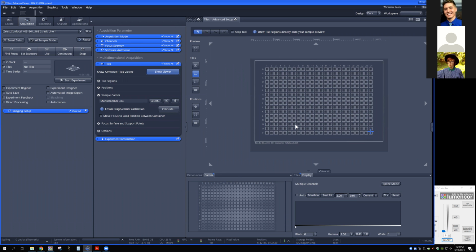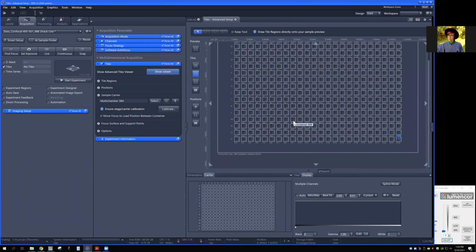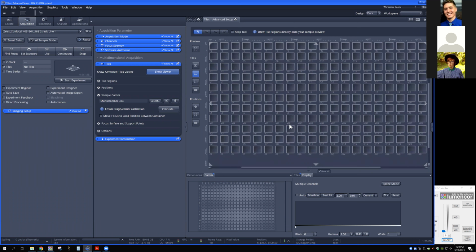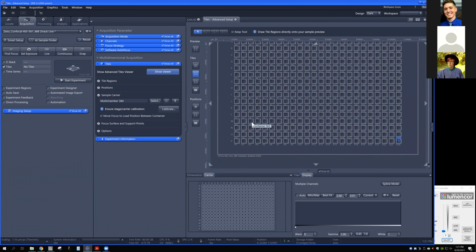And now basically what we have, especially, can we remember exactly which wells it is? It was M for sure, I think, right? M and N. M and N, okay. And then there's 2 empty rows on the edges. Oh, on either side? Yeah. Okay, great. All right, so we could maybe just go over here. Yeah, there's some there.